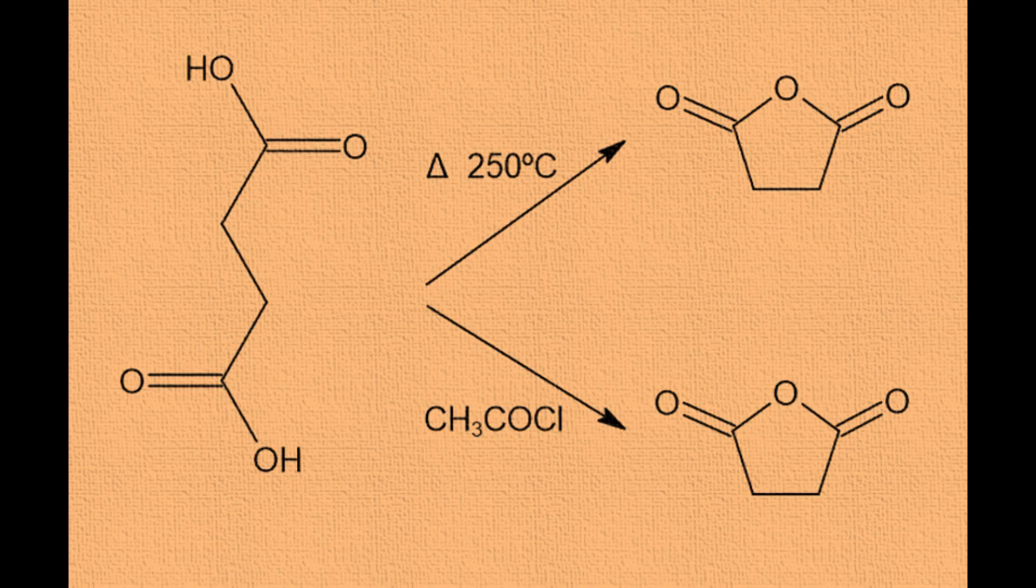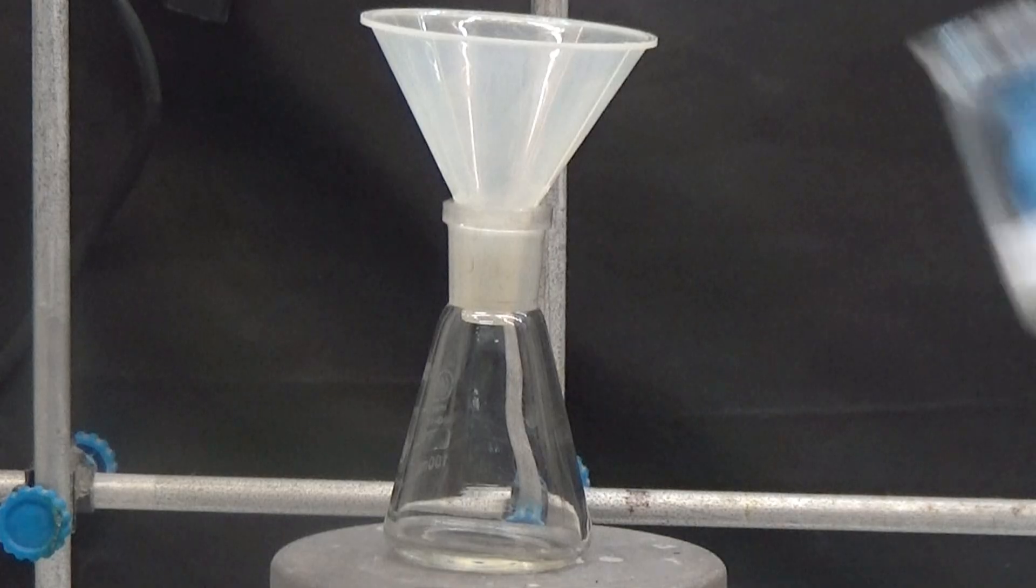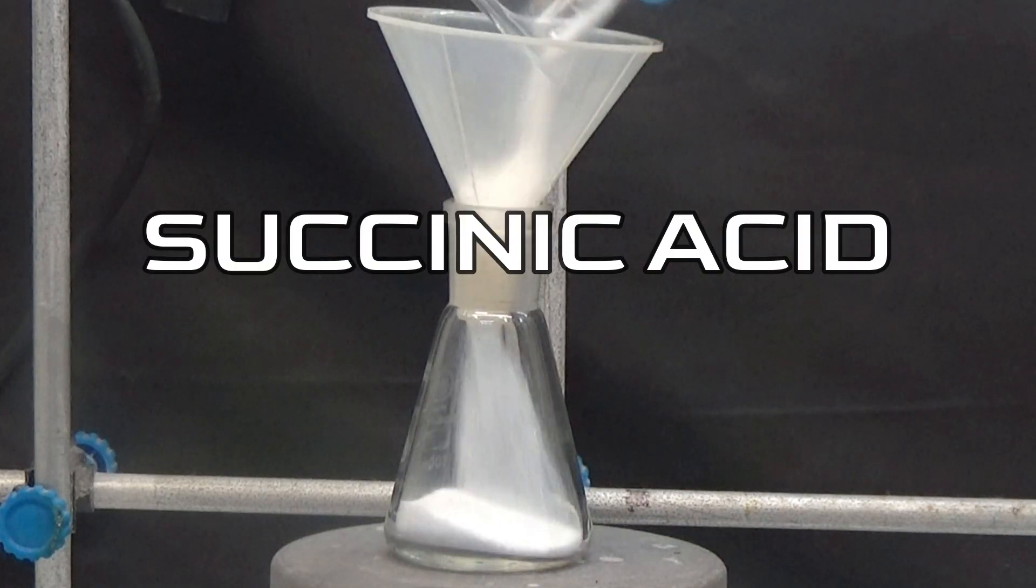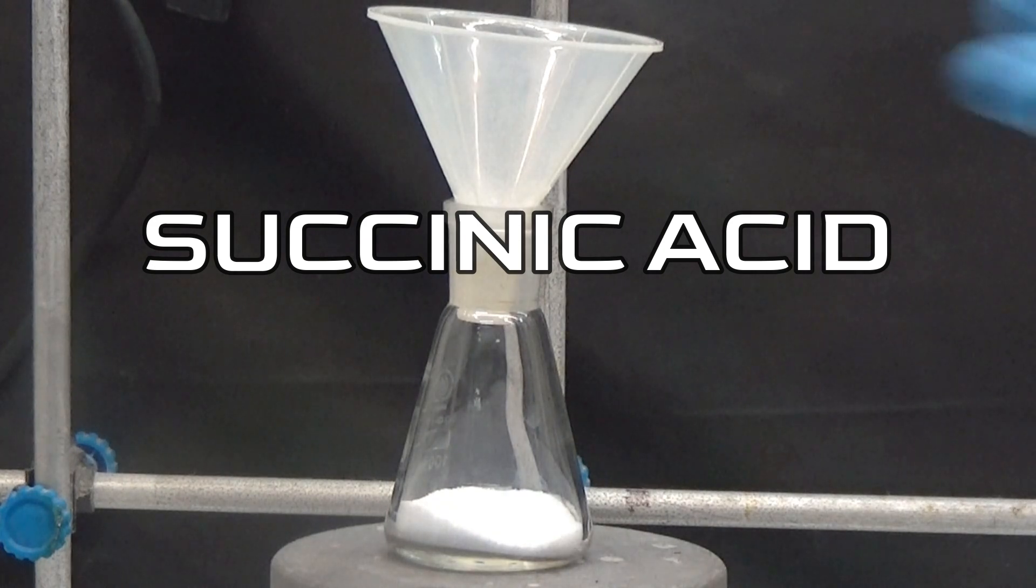In this synthesis, I will use two different processes. One is economical and the other is more expensive. As a starting product, we will use succinic acid, which is easy to find and inexpensive.